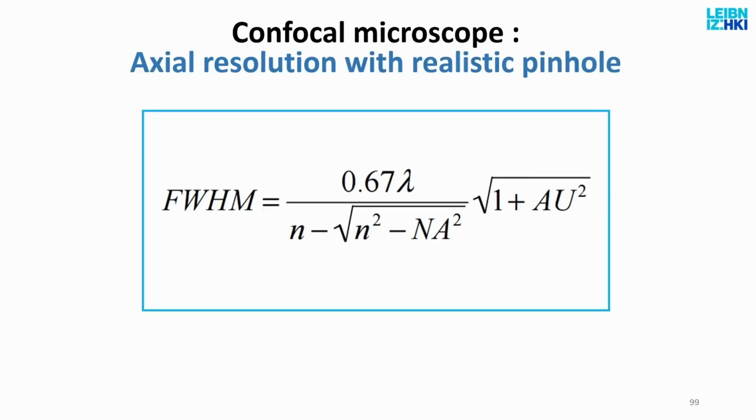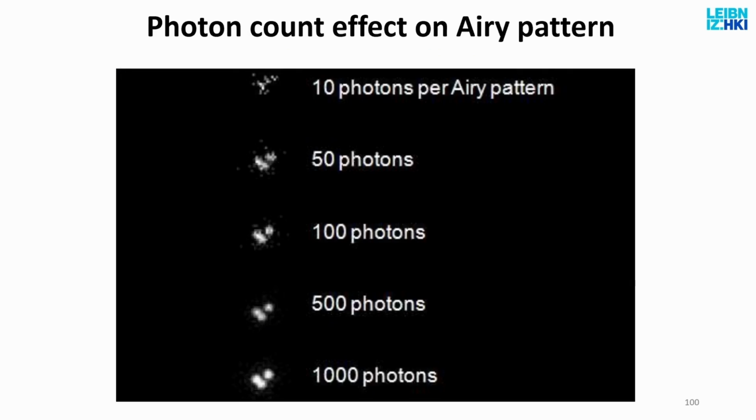And this is the axial resolution. Again, you don't use this formula directly, but when you use the software on the microscope, they will tell you, like, under these settings, what is your so-called optimal step size? And that's based on this formula which they calculate. So you don't have to do that, and it depends, of course, on the pinhole size.